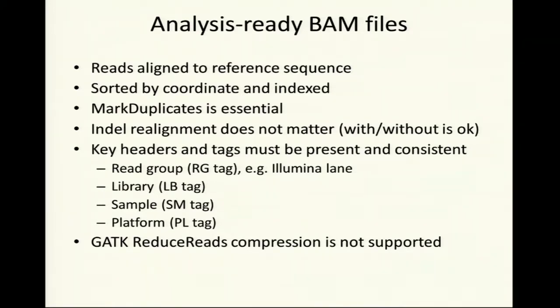So the analysis-ready BAMs, as I mentioned, you probably heard a lot about this morning. It's essential that you do mark duplicates. Indel realignment really doesn't matter. If you've indel realigned your BAM files to use them with the GATK, it's fine. You can run them through Genome STRiP, or you can run them without. As far as I know, it doesn't really make any difference.